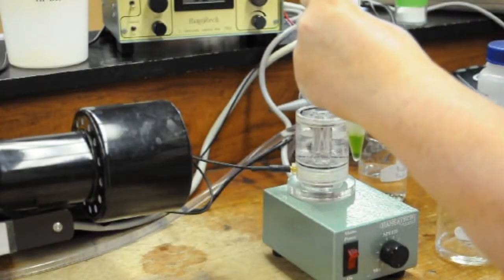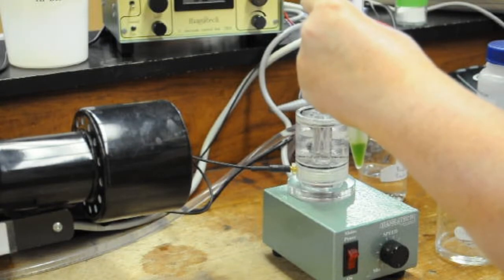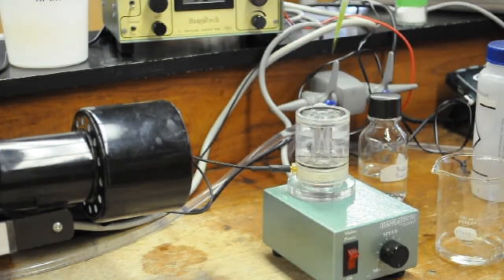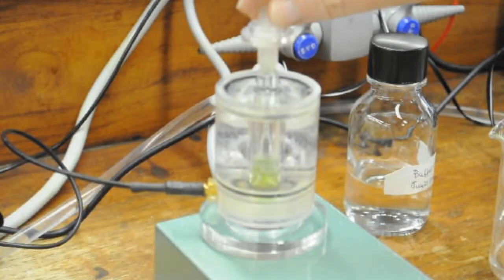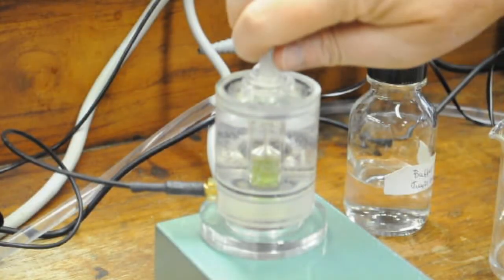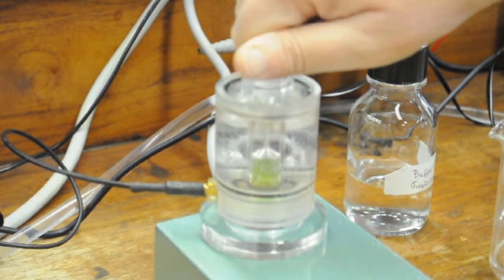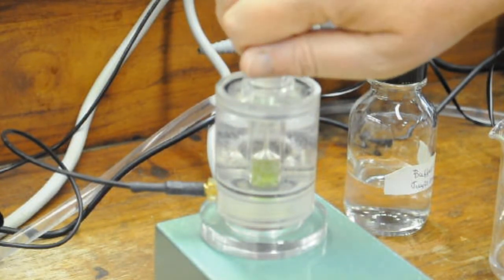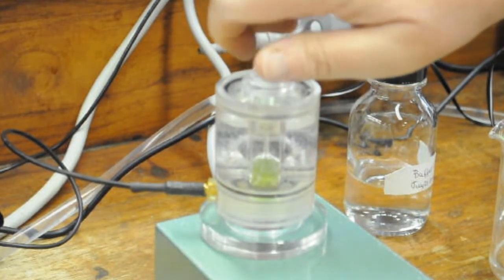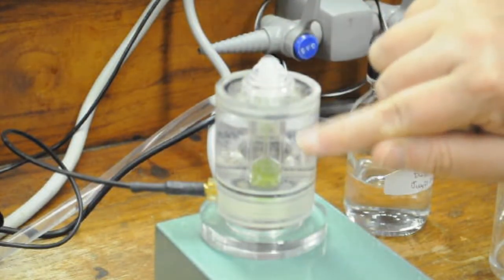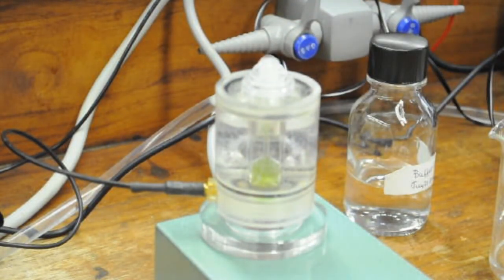Before adding your cells or chloroplasts to the cuvette make sure they are well mixed as they tend to settle out. You want to make sure you use a consistent sample in every experiment. Now insert the cuvette plunger into the opening. Once inserted the plunger is moved up and down using its screw. Lower the plunger until the dome is completely full of sample and the sample is pushing up into the threads of the screw. This is critical for you to get accurate measurements of O2 exchange.